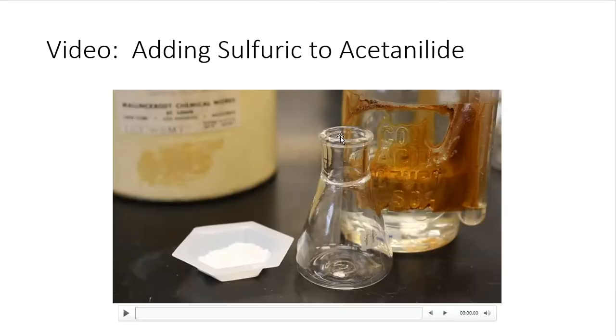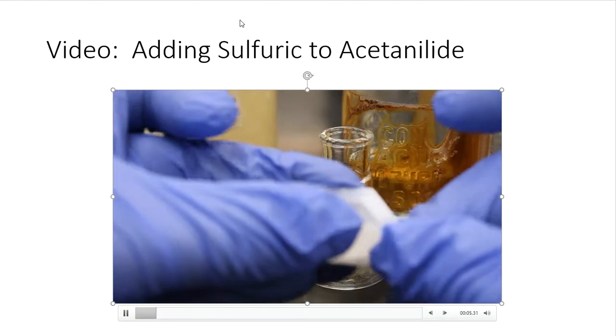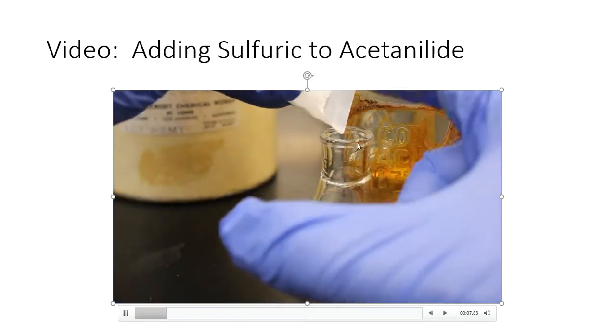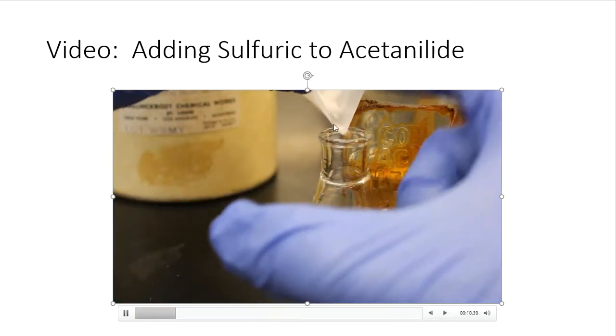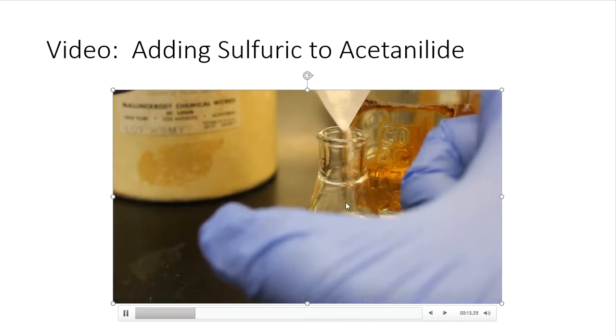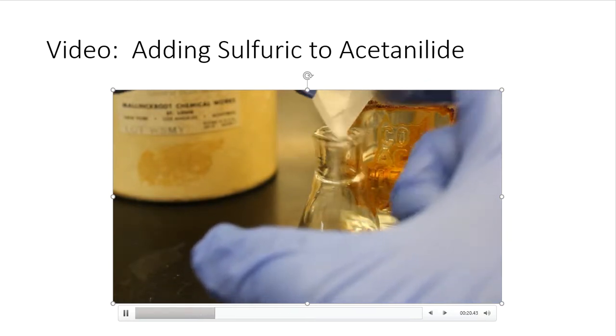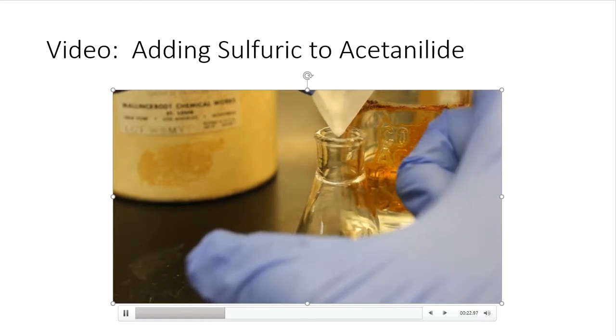I'm going to add sulfuric acid to each one of these 3 components for each one of these labs that we're going to be doing. So the first one here is adding sulfuric to acetanilide. Common trick in a lab, your weigh boats, fold them in half, give you a nice little spout to knock all of your solids down into. It's one of the reasons they're made that way instead of a flat little square or a circle.